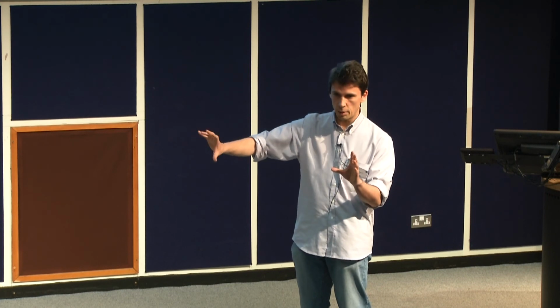I wouldn't say so much it depends on the order, but normally, for instance in 2D classification, I use a screening that rejects very bad things, and then Relion concentrates everything into a few classes. The bad ones are really bad, but if you look at the images in the good ones, they are not always good.